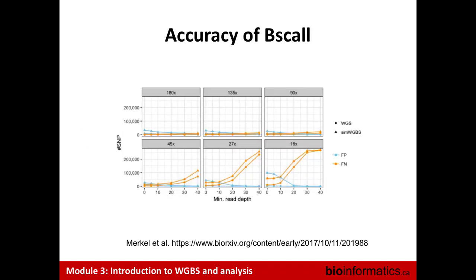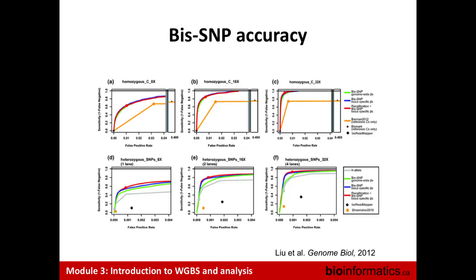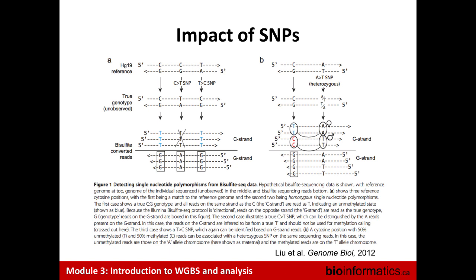Yes. So typically, we do the SNP calling at the end, which is true, like the case that we showed here. Right. That's a good question. I think the SNP calling takes as input the methylation calls as well and will change the methylation calls at the same time, but I'm not even sure. But it also takes into account dbSNP. So I think that's what you're saying. Oh, that's right. So the reference is SNP aware.